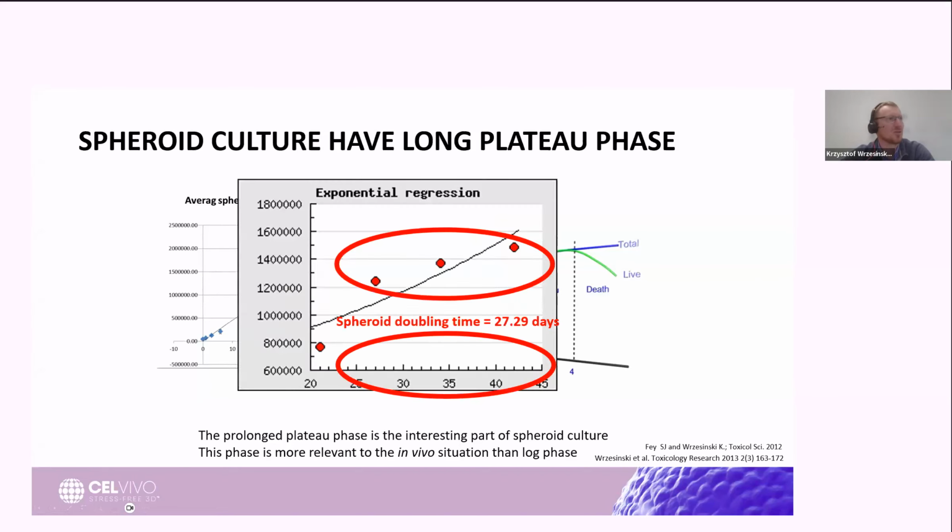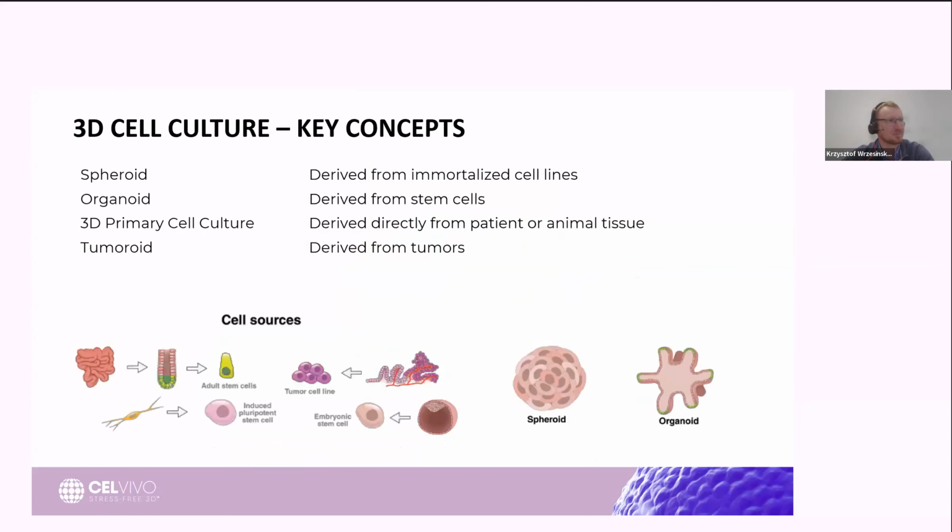In the case of our liver model, we have documented a stable plateau phase for over 21 days of the functional equilibrium, as we call it, in a 42 day culture period. This stable reactive window allows us to perform physiologically relevant repetitive experiments. That was very important for our research.